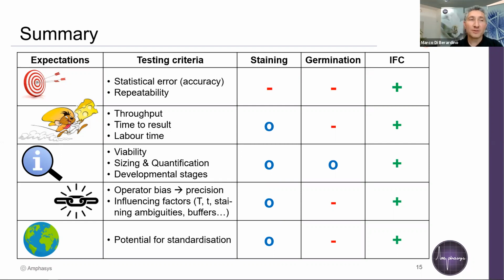No, let's put it this way. We use the same batches normally, but as the germination media and the measurement media that we use for the analysis are in most cases different, it's quite difficult to centrifuge them and resuspend them in the other media for doing the analysis. So we just use the same batch, dry pollen, and put it one time on our measurement buffer, and on the other hand on the germination buffer.